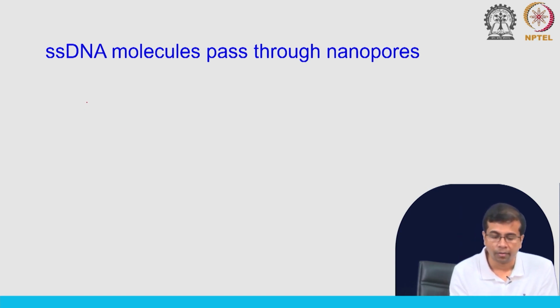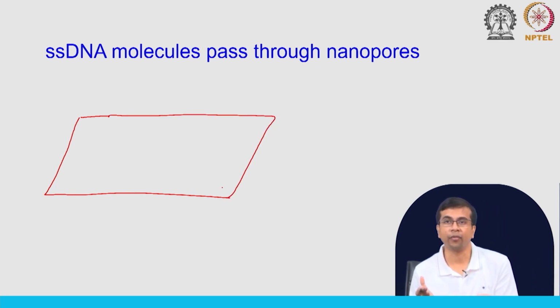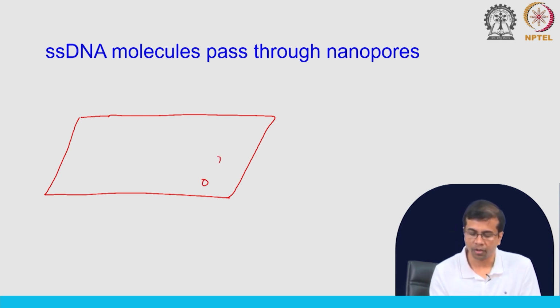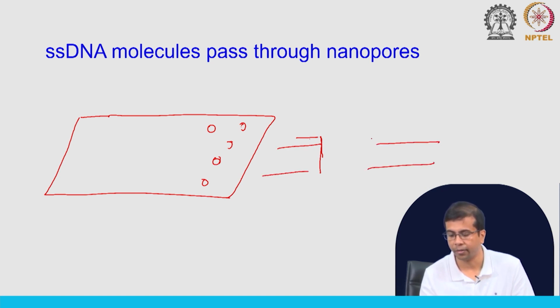So, you can imagine a flow cell. The sequencing happens inside a flow cell, you need something like this, either a SMRT cell, flow cell we have seen, or picotiter plates. So, here you have a flow cell where the sequencing happens, and on this flow cell you have millions of these very small pores, and these are called nanopores. Okay. So, they are actually small structures that are embedded on a kind of matrix.